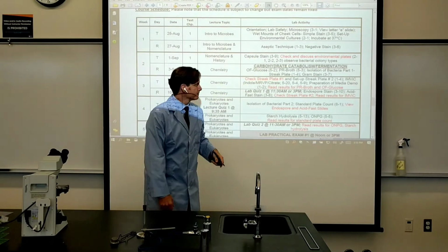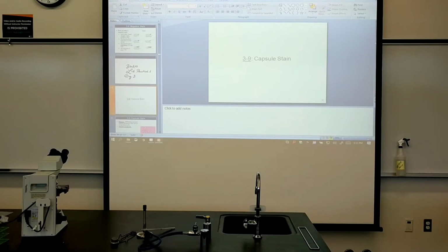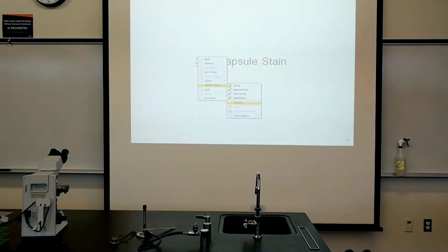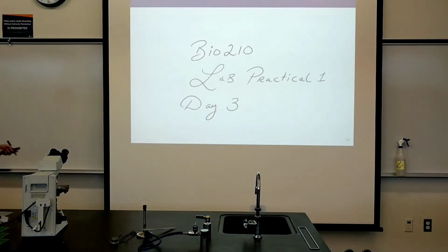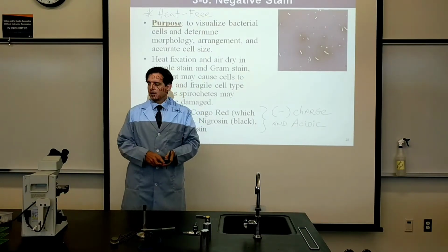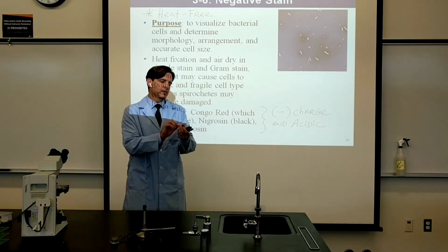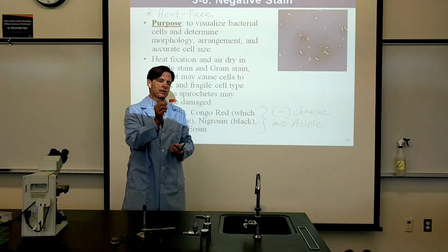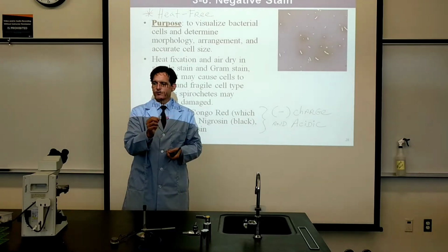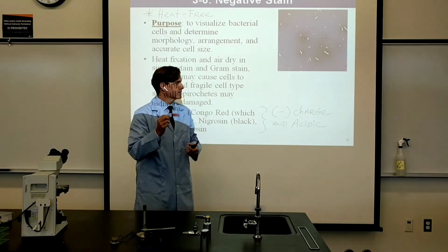And now it's time to resume, starting our coverage of today's activities. And we'll start by looking back at the negative stain. If you recall from last lab activity period, I made a negative stain right here, and I didn't put it under the microscope to show you guys. So what I'm going to do is take you in for a close-up view. We'll take the camera and we'll see what came out of this negative stain.